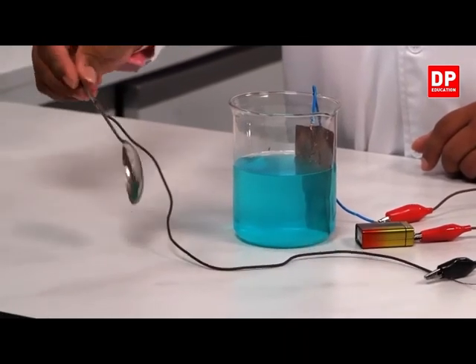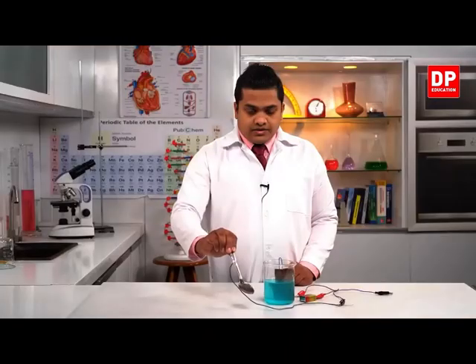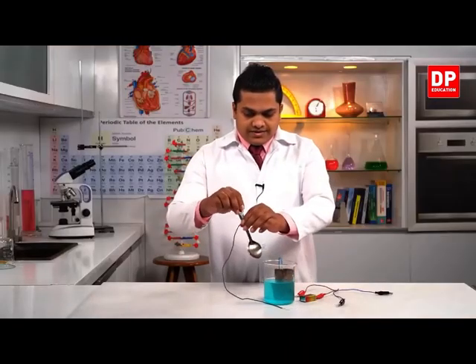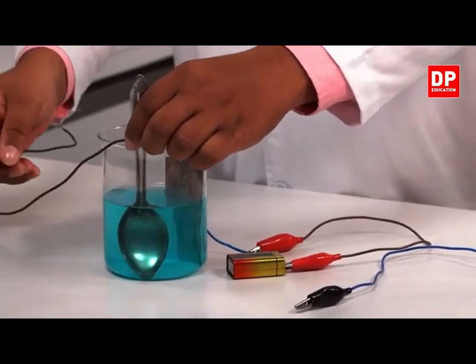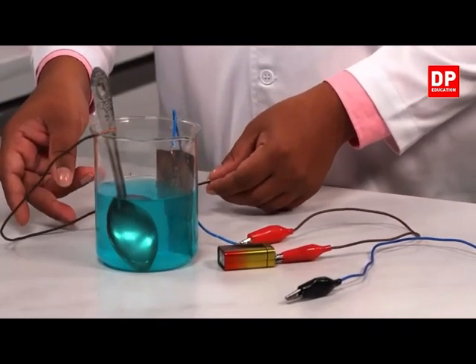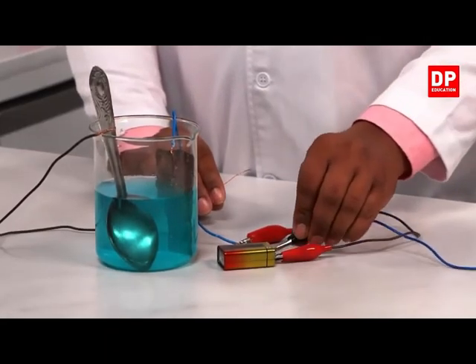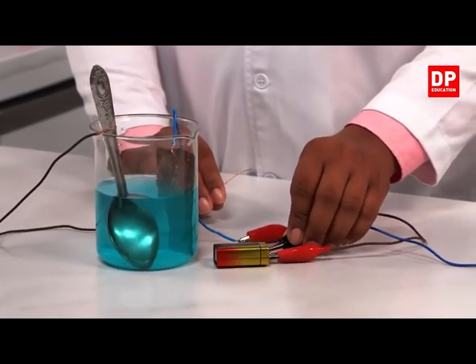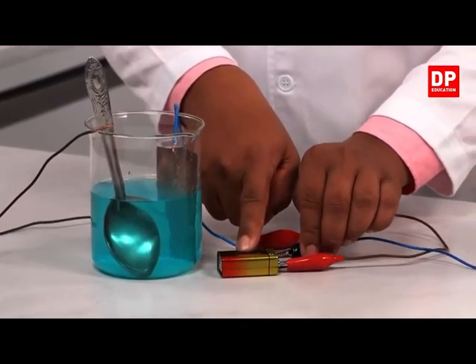You can see it very clearly, right? There's nothing here. I'm going to insert it and make sure that they do not come in contact with each other. Then we'll connect it with the negative terminal of the dry cell.